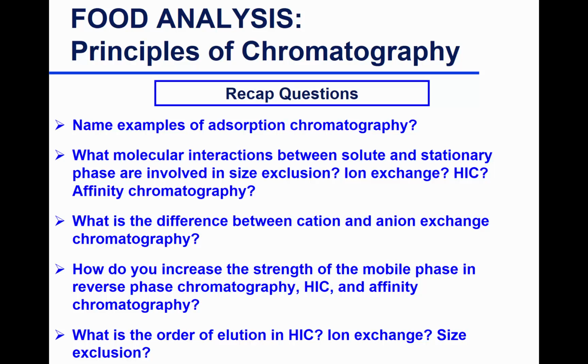What do you start your mobile phase with? Yes, so you start with a high salt concentration, and now they're interacting with your column. They're precipitated on your column. How do you get them out? Yes, so you reduce the salt concentration, so now they like your mobile phase more, so they leave the column.